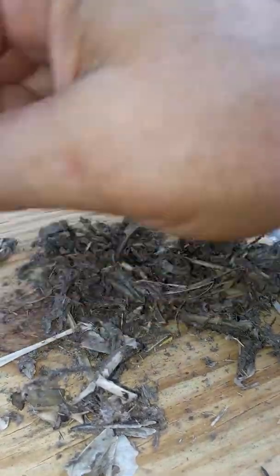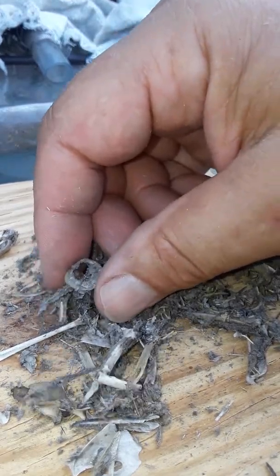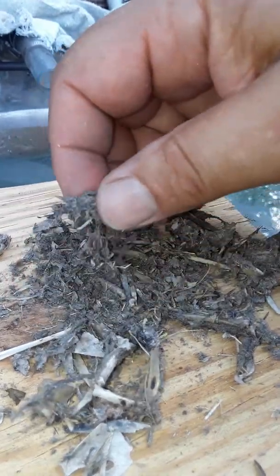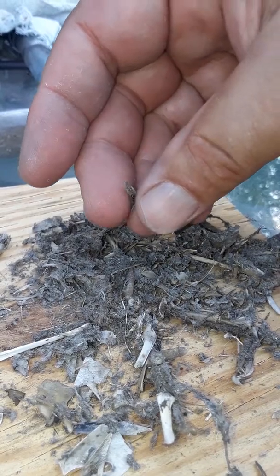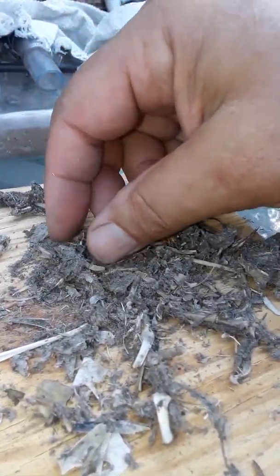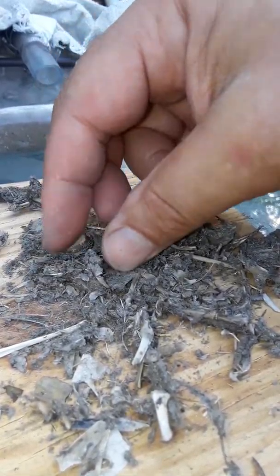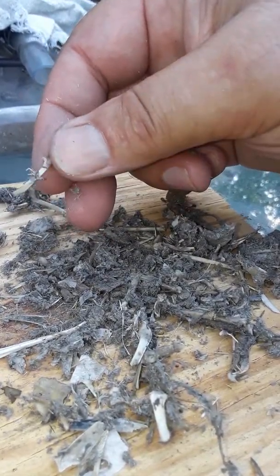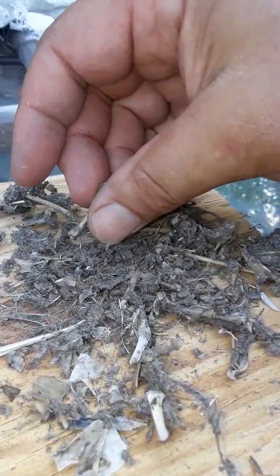I don't find owl pellets all the time, but when I do I like to go through it to get an idea of what they've been eating. There's that foot — let's see how many of those we have. That's a long one. There's an orbital, there's a pelvis. Boy, he eats bones and all. There's the second orbital.